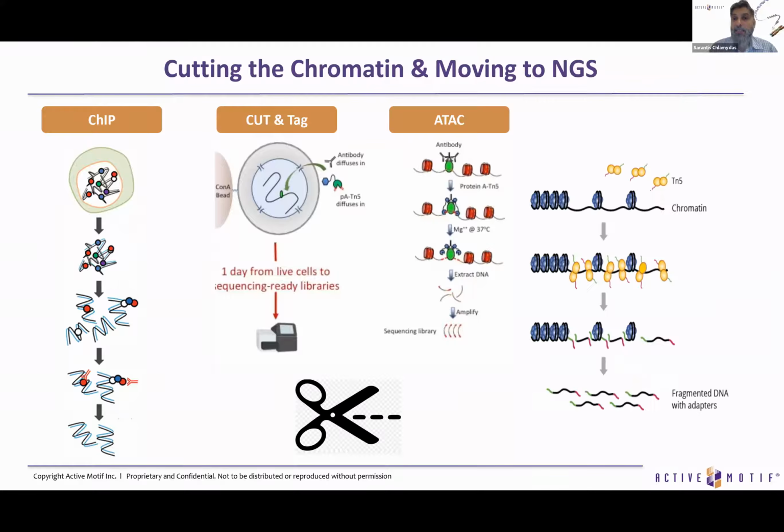And last but not least, ATAC-Seq is a non-antibody-based protocol where we use a transposase to integrate sequencing adapters at the open chromatin regions. At the end, we sequence the open chromatin regions. Active Motif offers a complete toolbox for all of these techniques, including kits, assays, but also end-to-end services.